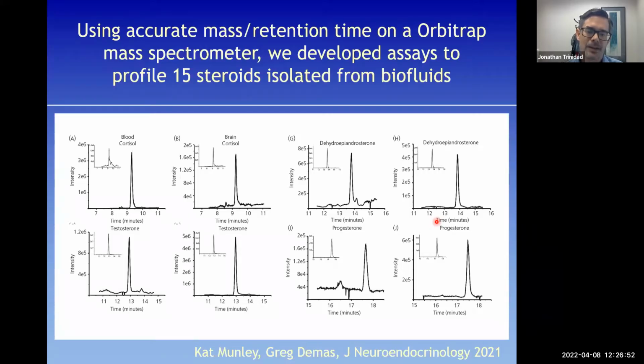We actually did these experiments on an Orbitrap, where we would get the selectivity, the SRM aspect of the quantification, by doing high resolution extraction of MS2 fragment ions measured out in the Orbitrap analyzer. These types of quantitative assays are often very sensitive because you have two levels of mass selection.